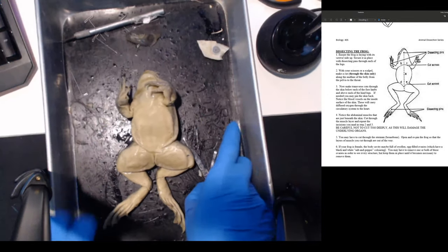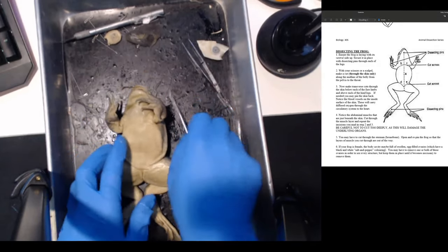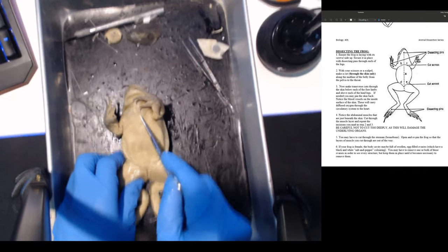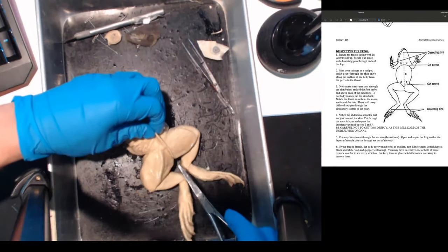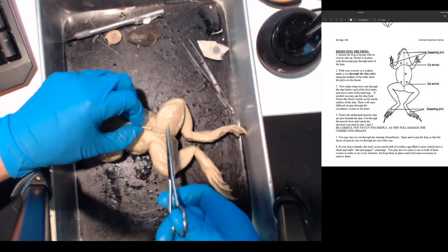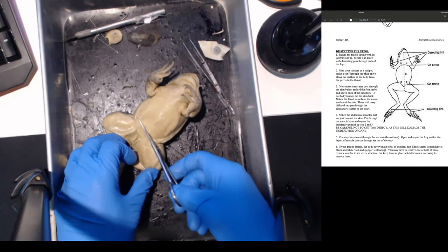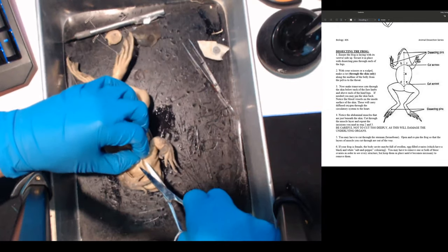I'm going to expose the belly and open up the abdomen. You're going to make a flap - make a cut here, then a cut here, and cut along the front to create two flaps. To do that, pinch the skin and then make a cut - pinching the skin prevents you from cutting into the muscle. Once you have that cut, you cut along and then turn and cut along the other side. The skin isn't attached that well.